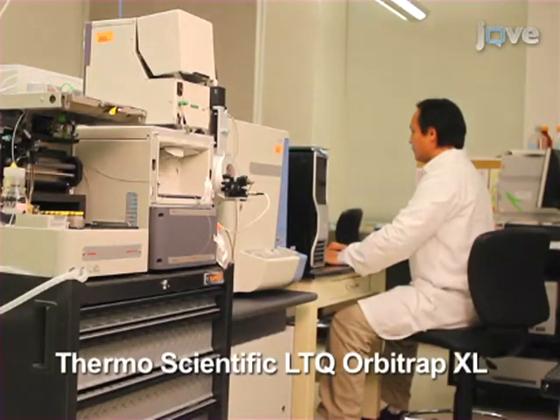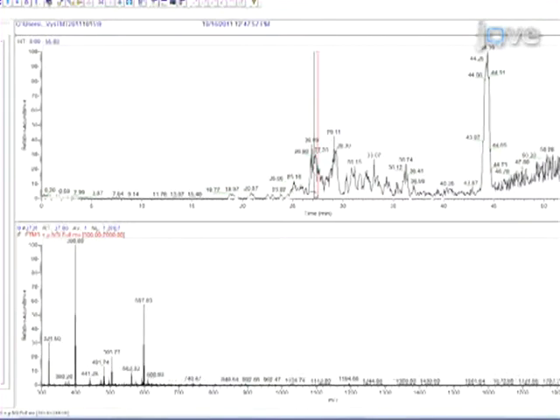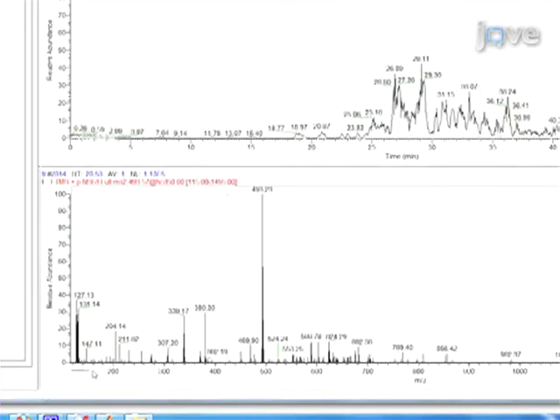As detailed in the accompanying text, use mass spectrometry to detect peptides. In a top 2x3 workflow, start with a single-stage MS, then acquire 3 MS-MS spectra with higher energy C-trap dissociation fragmentation, followed by 3 MS-MS with collision-induced dissociation for protein identification.